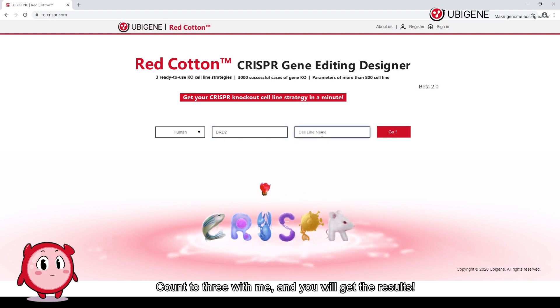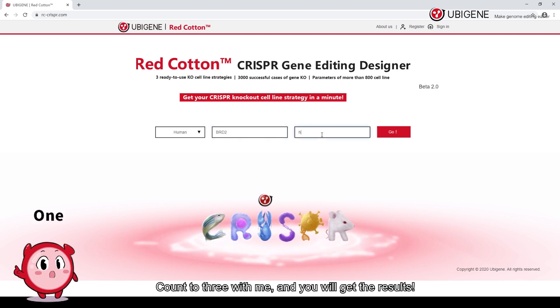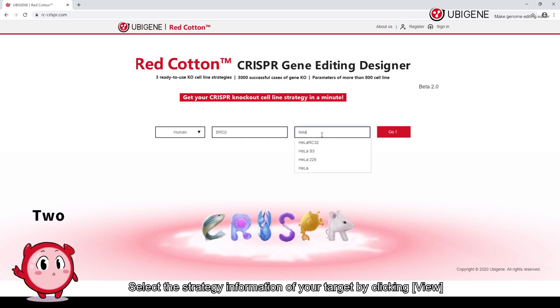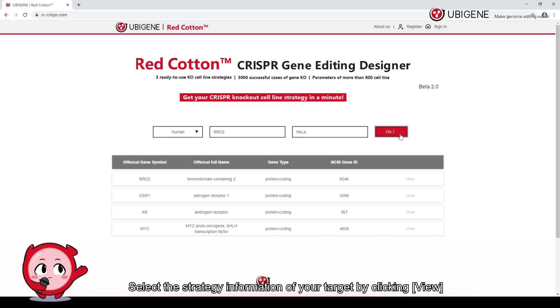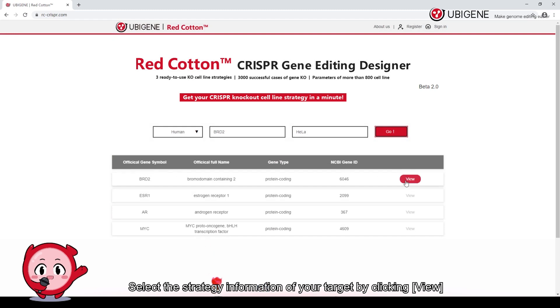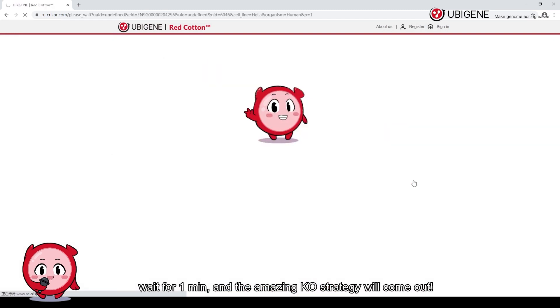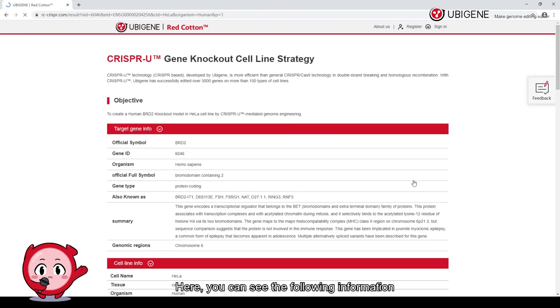Count to 3 with me and you will get the results. Select the strategy information of your target by clicking View. Wait a minute, and the amazing knockout strategy will come out.